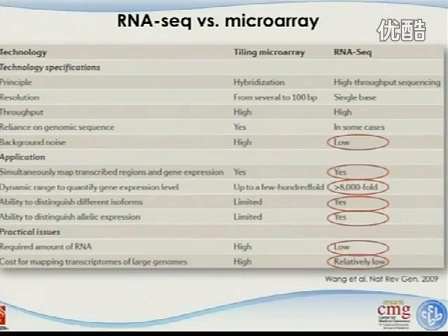It also depends on the technology being used, and we are doing SOLiD here, although I'm going to introduce one single cell example using SOLiD technology. But for some other sequencing platforms, like Helicos, it's intrinsically working on single molecules. So for some of the next generation sequencers this is true, but probably not for SOLiD and not for Illumina as well, right?